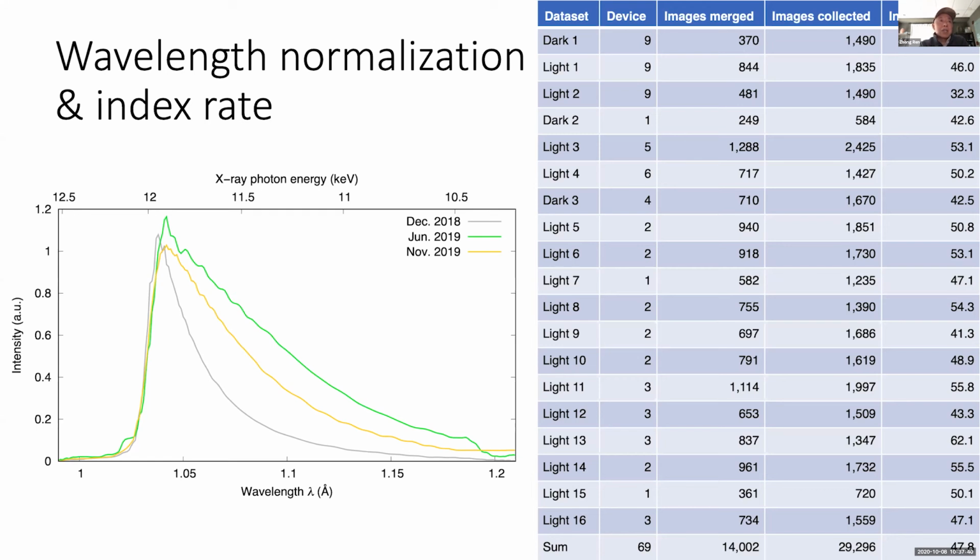I suspect this is because we are only accepting the central cone of the radiation that causes the particularly narrow bandwidth. But I cannot explain why in June of last year there is a particularly wide bandwidth. But anyway, all these potential systematic issues will be completely resolved by the software.